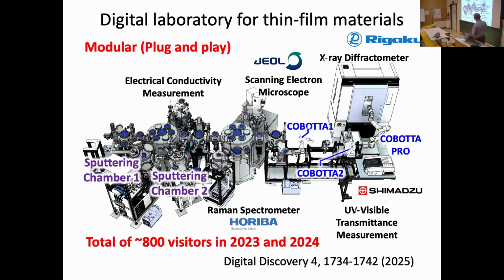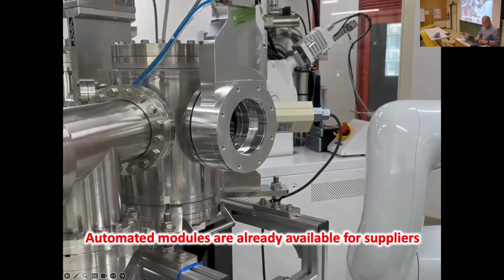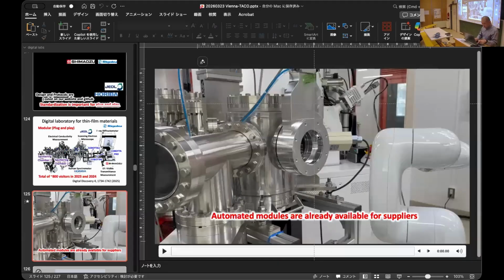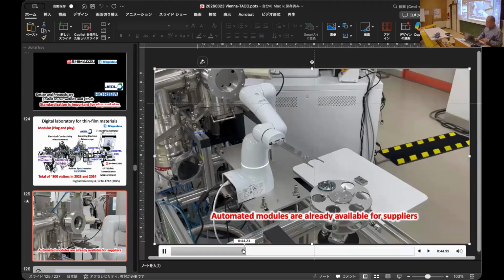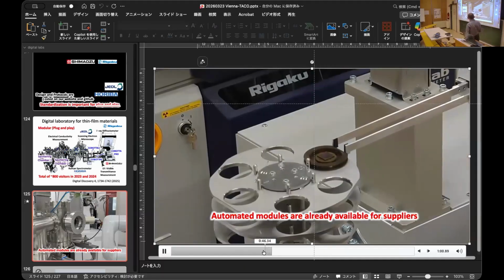And also this is directly connected to the scanning electron microscope. The sample goes into the SEM, and then the automatic focus, and then the EDS. All those are done automatically. And then take out to air. We have Raman spectroscopy, and then go to X-ray diffraction. So this is one example. We use these robots, and all these are the experiments for us.